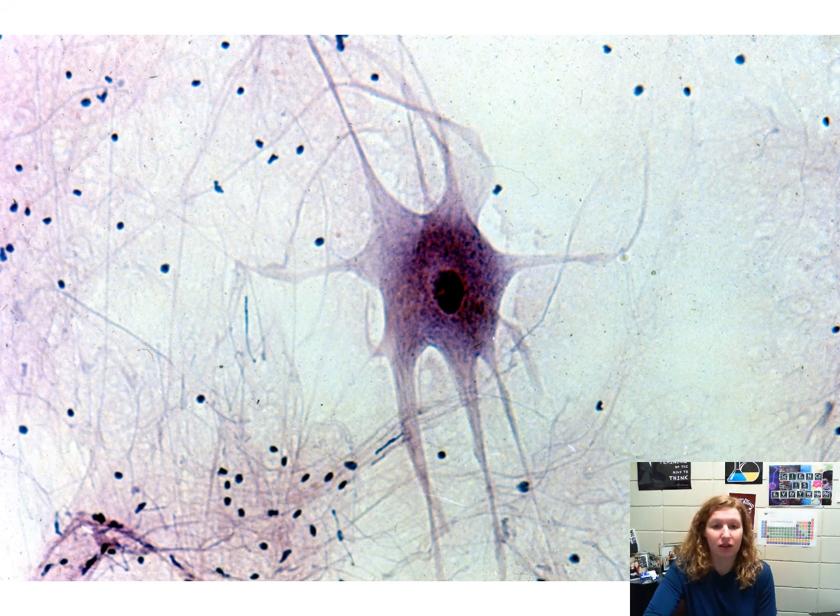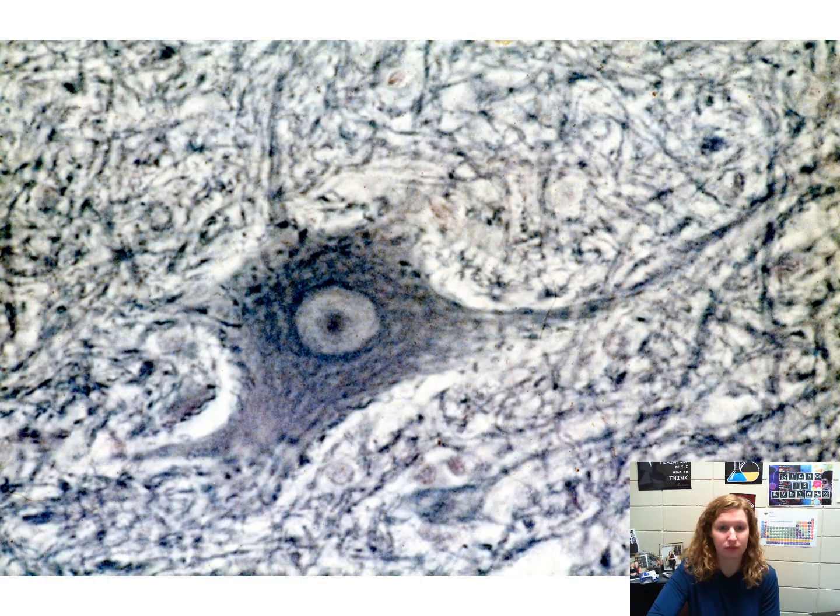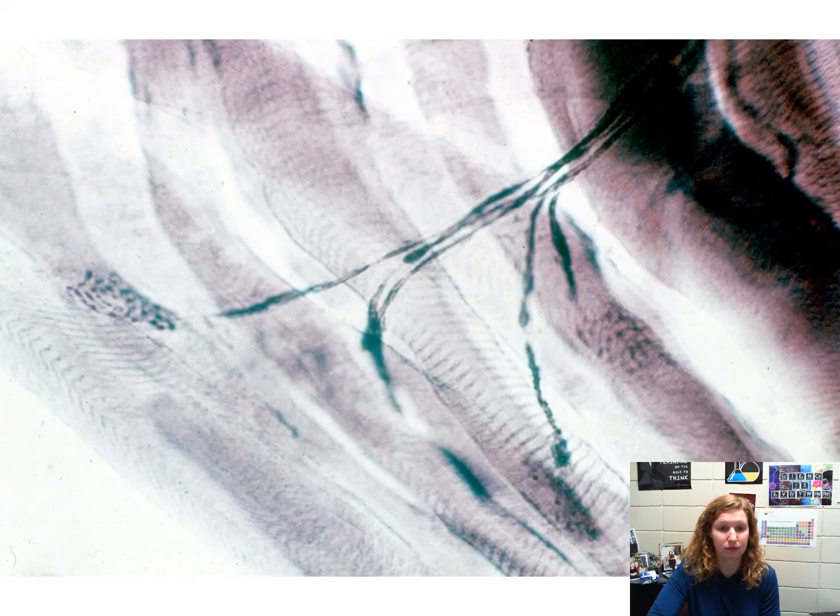Now this is a nerve cell. Nervous system tissue, you can see the neurons. This is a nerve cell. And this last one, this is a neuromuscular junction.